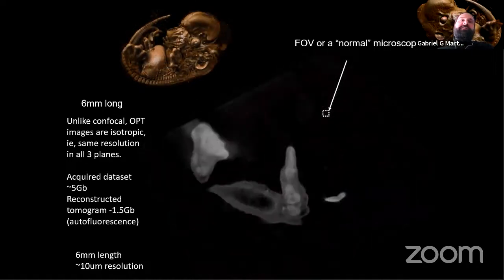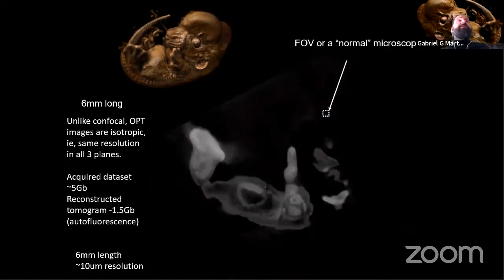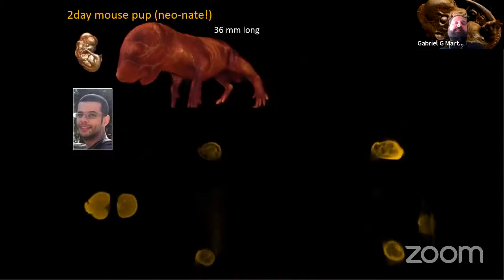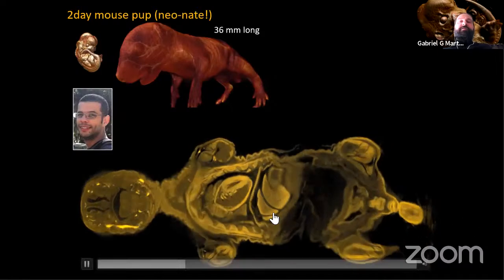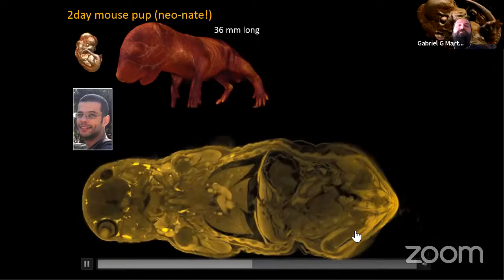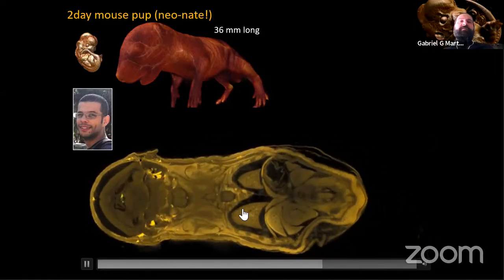And today it's actually quite fast. It's faster to do optical tomography than it actually is to do light sheet microscopy on very large samples like this. And we've been improving it. Olshanda has recently done very, very large things. It was actually done a while ago, but Olshanda has just improved this. We're doing things on the 4-5 centimeter scale with really high resolution, as in this example here.